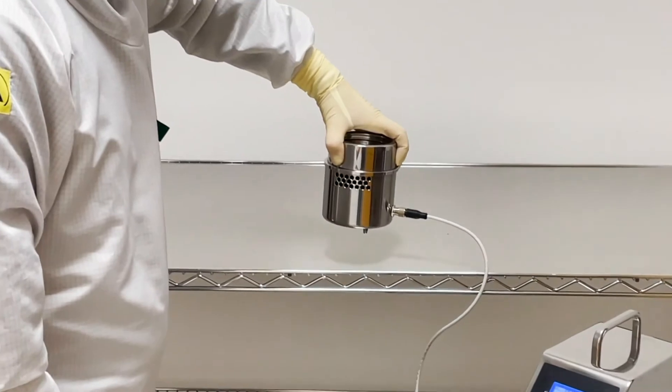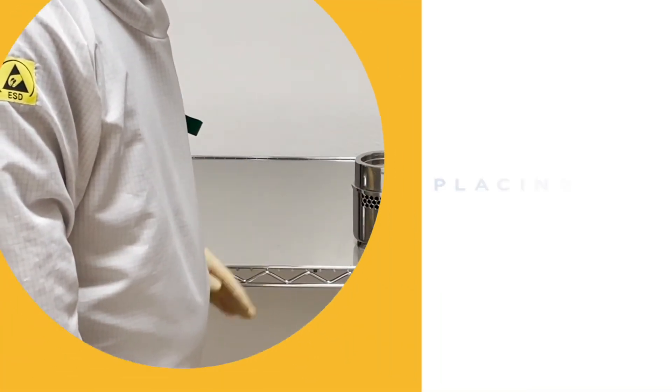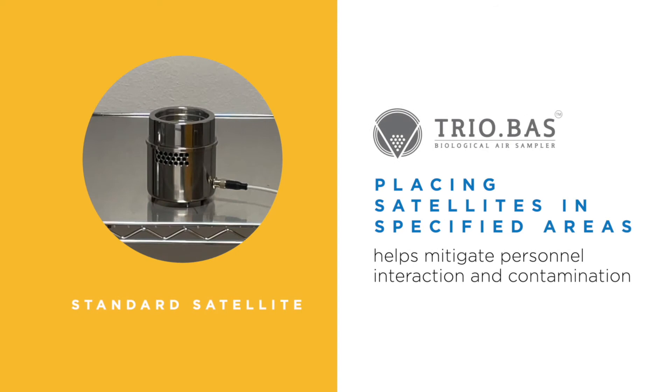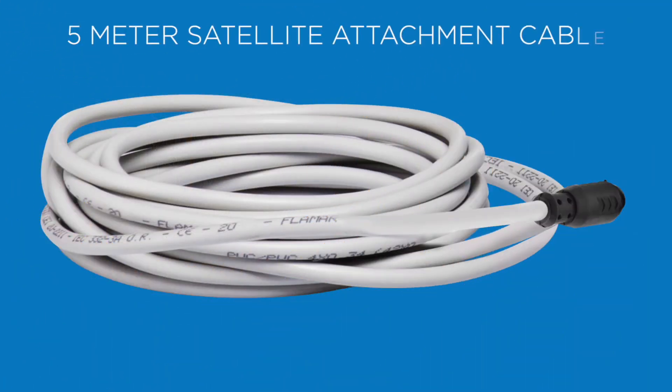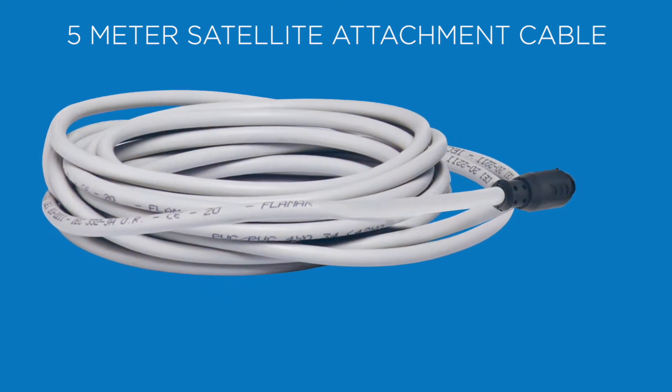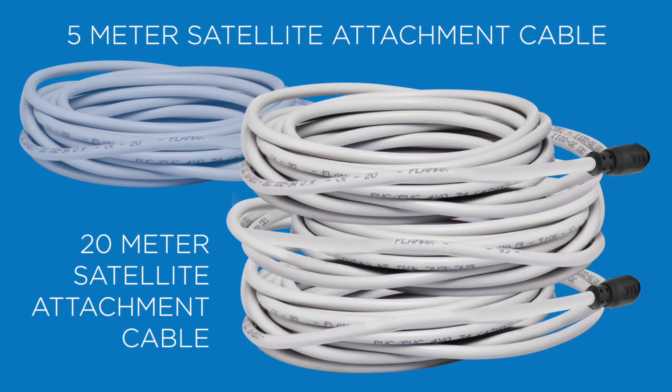The simple cable connection and ability to place the satellite in specified areas helps mitigate personnel interaction and contamination. A 5-meter-long satellite cable is included. If more coverage is needed, 20-meter-long satellite attachment cables are available.